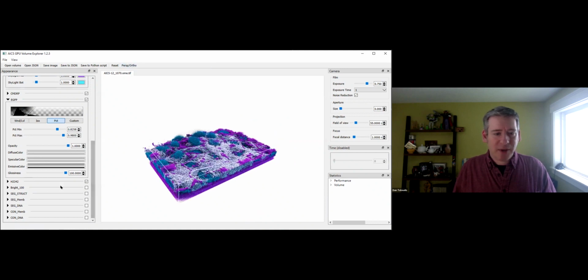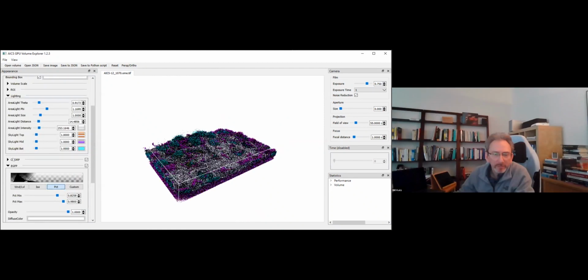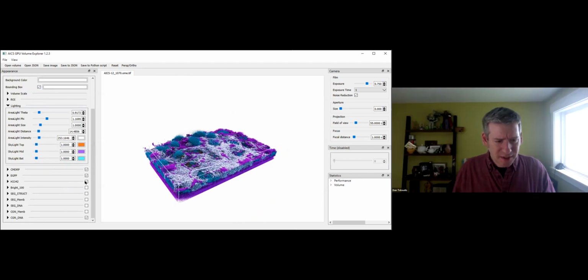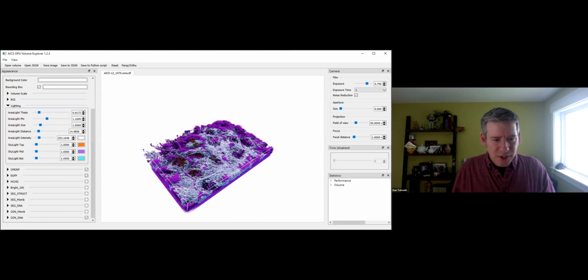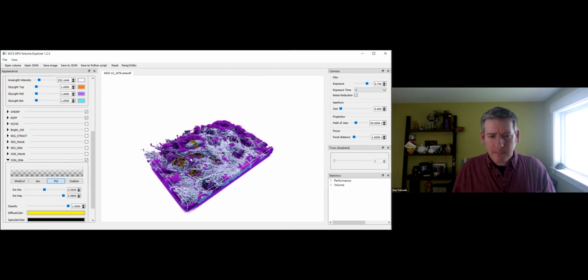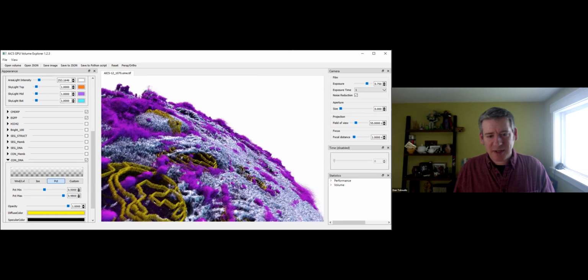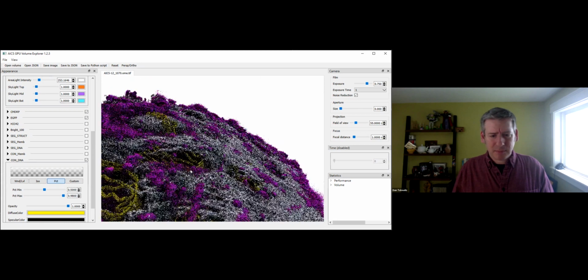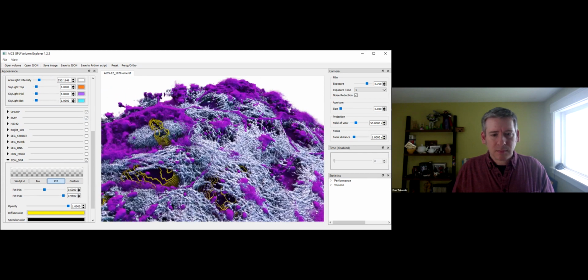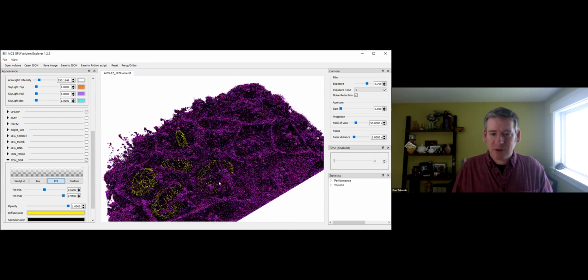It also helps a lot when you have some of this interesting derivative data. Like I can turn on this contour DNA channel and turn off my existing DNA channel. That's this one. And let me change the color. So now if I zoom in, I'm kind of mixing this calculated data with my raw data at the same time. So those are contours around our 5 segmented nuclei in this data set.